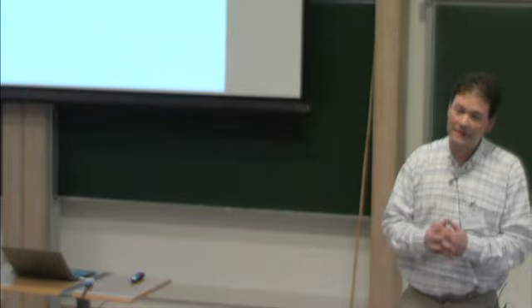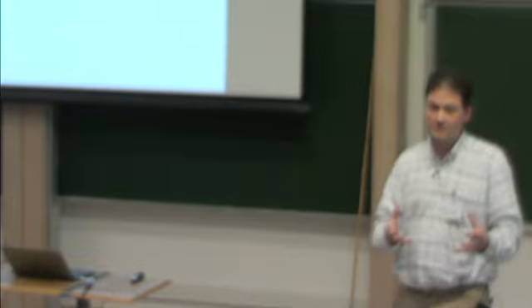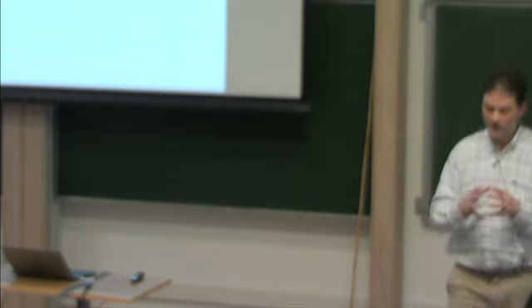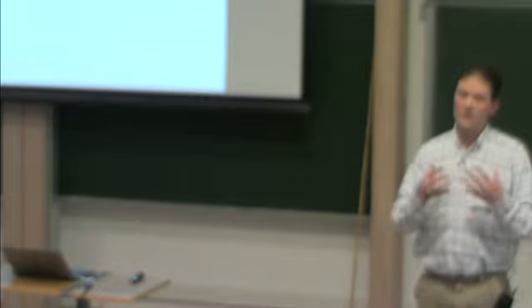We have actually also been looking at, what we'd like to do is acquire this sort of information in 3 dimensions, so then you get a full description of the flow. And there, obviously there's more data that you need, but what I haven't been showing here, we've been looking at using time as a 4th dimension, so you've obviously got sparsity in time as well. And so with a very sparse acquisition, but with enough sparsity in time, you can actually do 3-dimensional images on a time scale which is not much longer than what we've got here, but with 3 space dimensions and with 4D reconstruction on that.